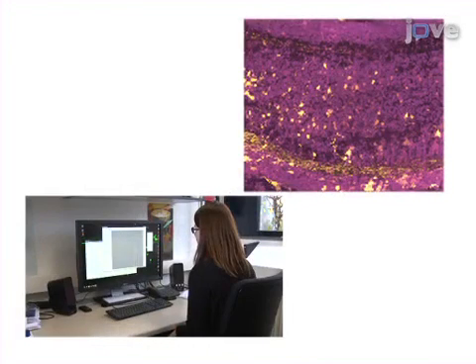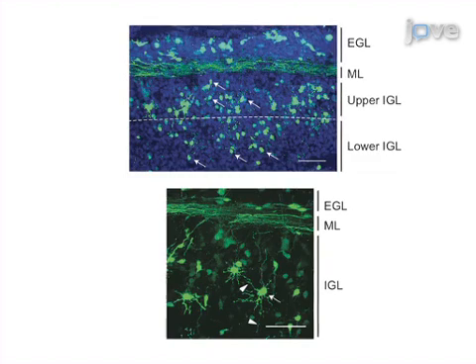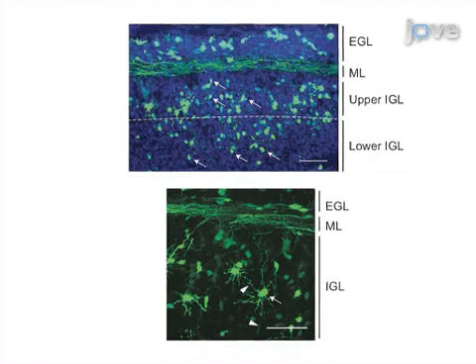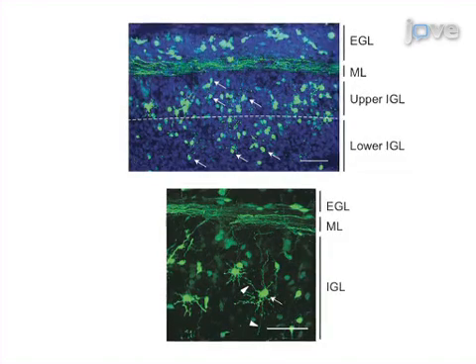Next, the immunostained sections are imaged in order to measure the distance of neuronal migration and the length of neuronal processes. Results obtained will show the effect of the protein of interest on neuronal migration and morphology in the developing cerebellar cortex.